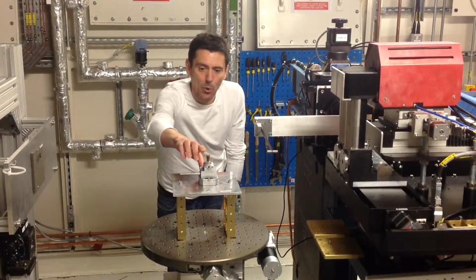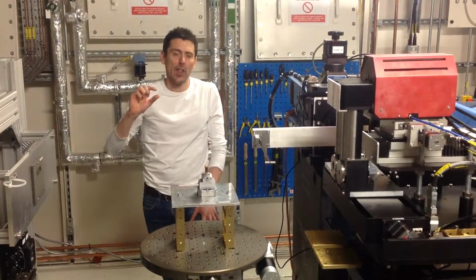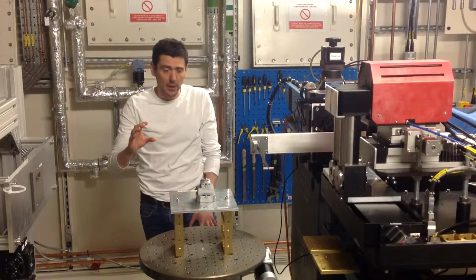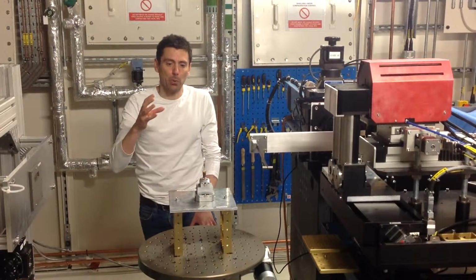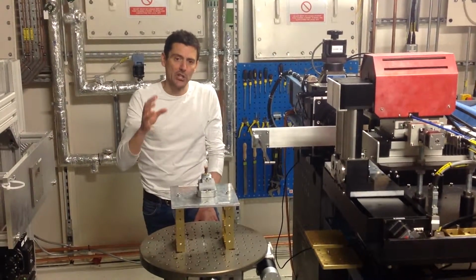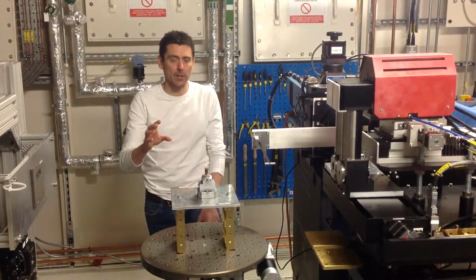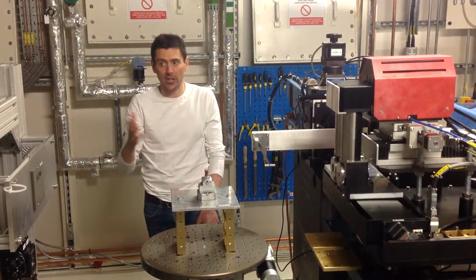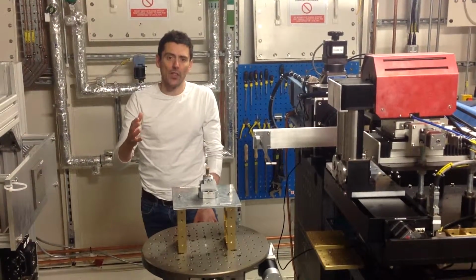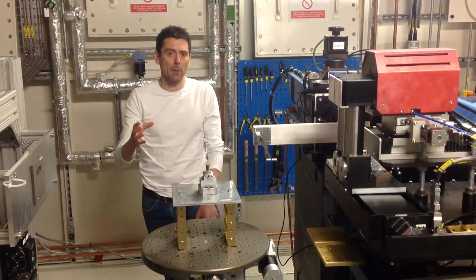And so what you can see in front of you here on this small plinth is a small vessel that contains a 6mm soil aggregate that we have taken from a soil profile in Nottinghamshire. And we have put this in the laboratory and used a chemical compound, osmium, to stain where the organic carbon is within that aggregate. And then we brought our samples here to the Diamond Light Source to study them with a high energy synchrotron radiation X-ray beam.